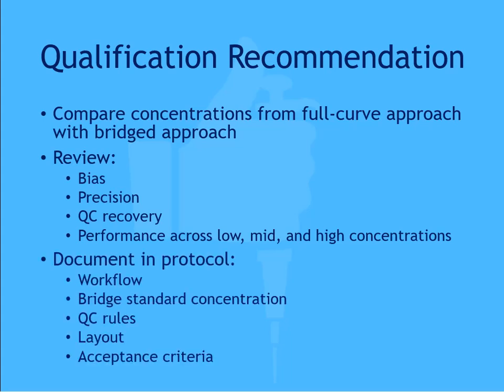Once the approach has been validated, the workflow, bridge standard concentration, QC rules, plate layout, and acceptance criteria should be documented in the assay protocol. Acceptance limits, QC rules, and suitability of this approach should be defined by the user based on their assay validation requirements, internal procedures, and intended use. For regulated studies, users should ensure the workflow meets applicable validation and reporting requirements.